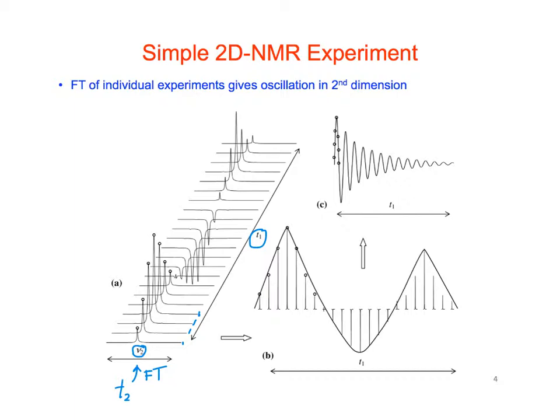Right? But we did a whole bunch, and it started going up, it went to a maximum, and then it came back through 0, and it went negative, through another 0 up here, positive, and so we're doing a whole bunch of, these are each a one-dimensional NMR experiment, each horizontal line.